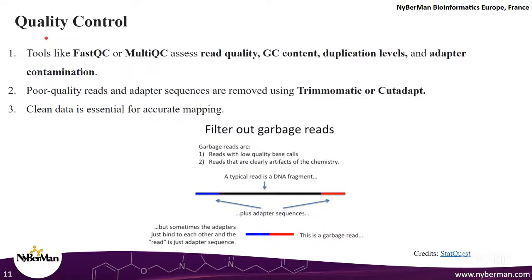Okay, so here basically we try to calculate some metrics such as read quality. Again, what read quality is, we will understand in one of the upcoming sessions where we actually perform FastQC and MultiQC.